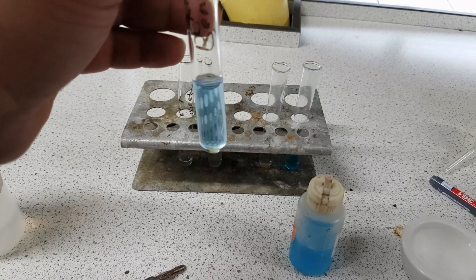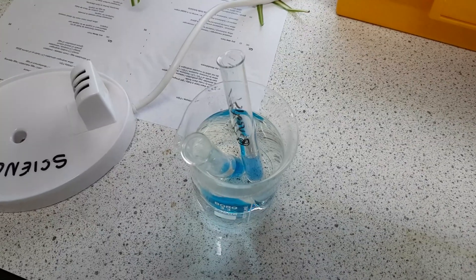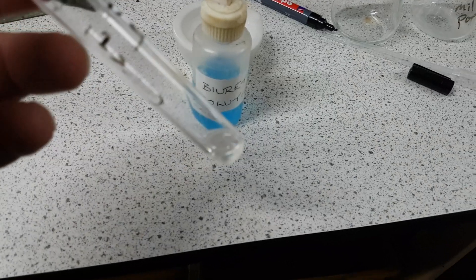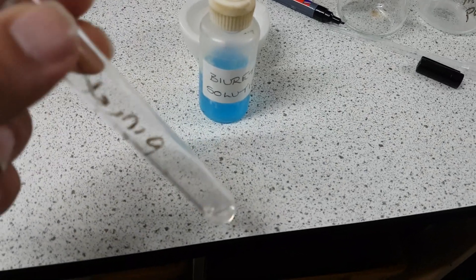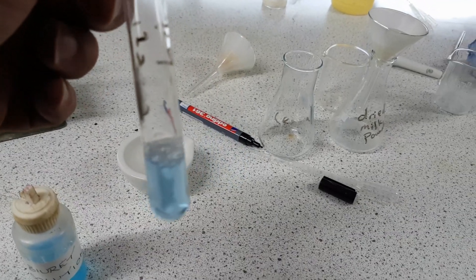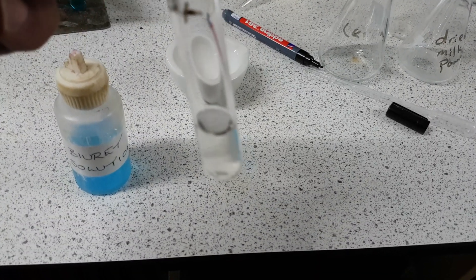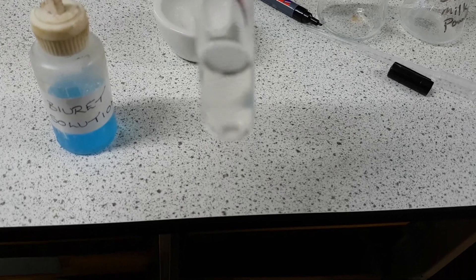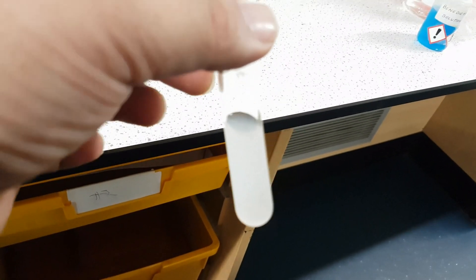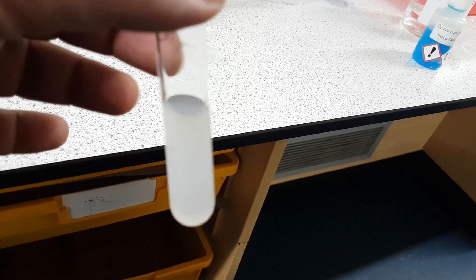So I've added the Benedict's and I'm going to put this into a beaker of hot water as I previously did. I'm just going to leave it in there to see what happens over time. With my second solution I'm going to add the Biuret to the cereal — that has stayed blue which means it's a negative test. And finally I'm going to add ethanol to this and see what happens. If you look here it's gone cloudy, which means that there is fat present within the cereal.